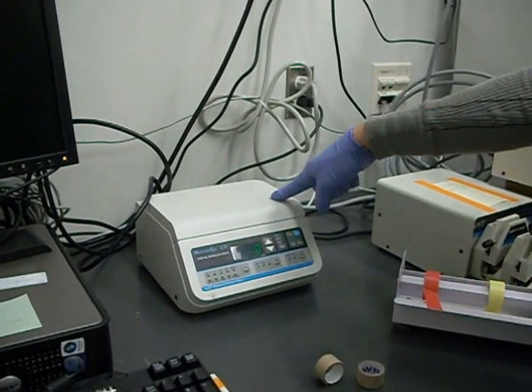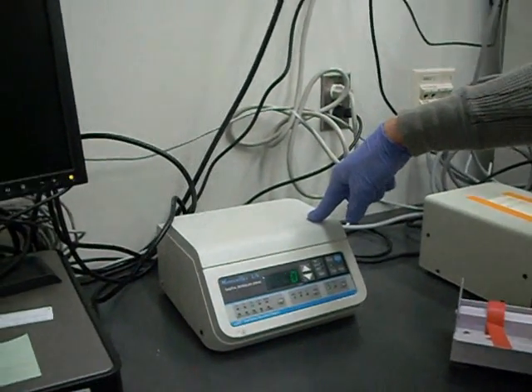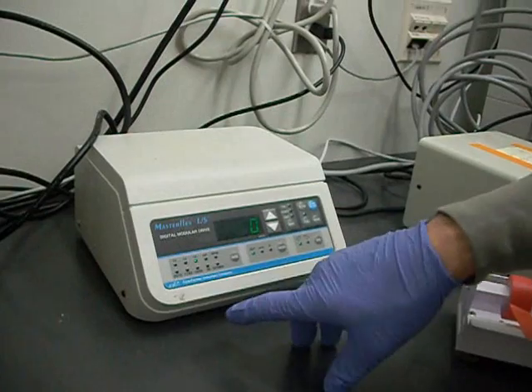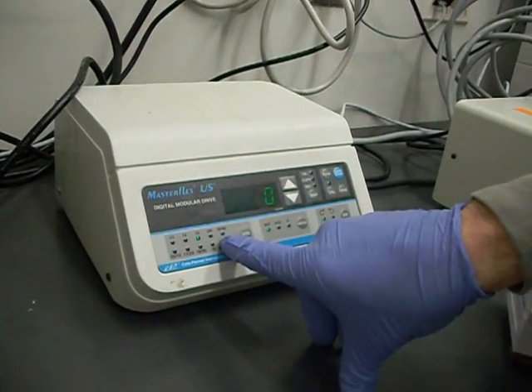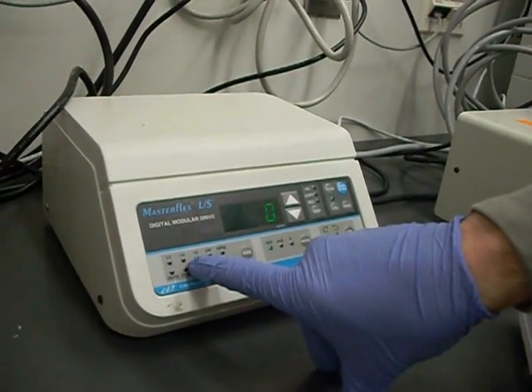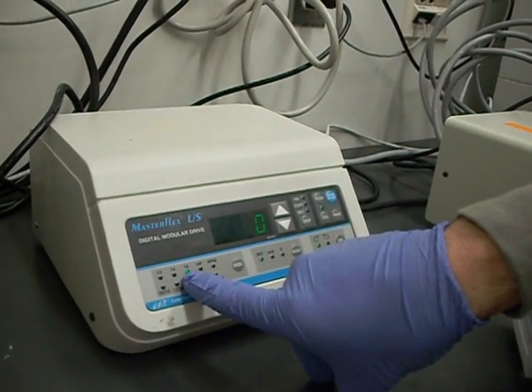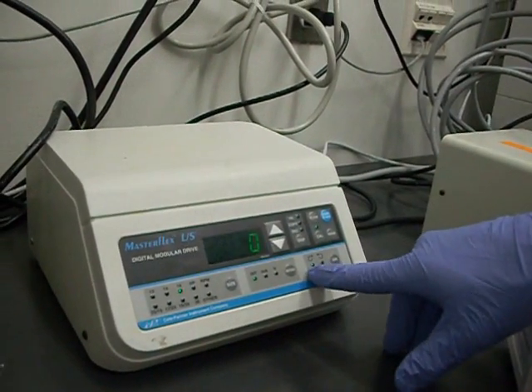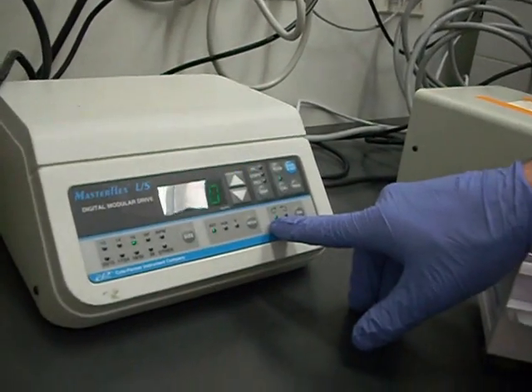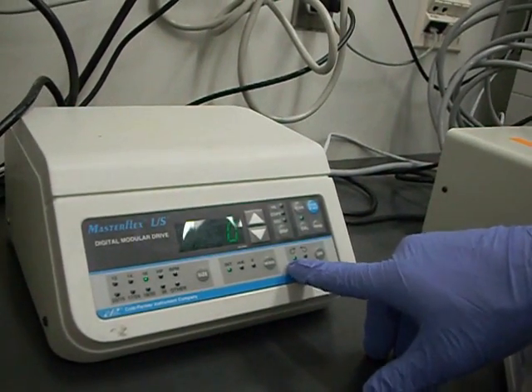This is our modular drive control for the pump. The important thing to make sure is that you have the correct size selected. We're using 16 tubing, so we have that selected here. And you have the correct direction of the pump. And then you're ready to start.